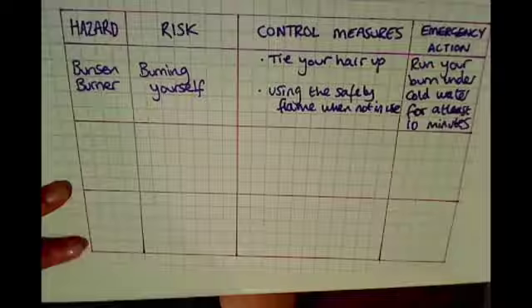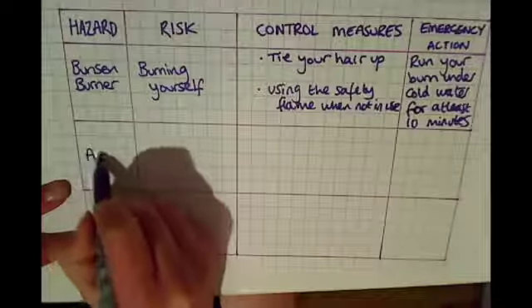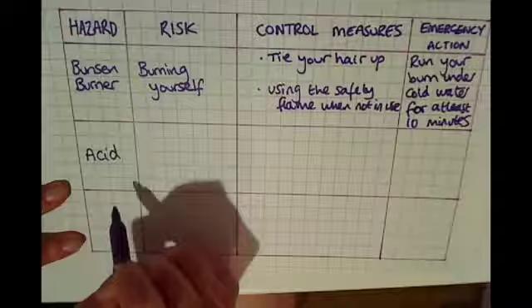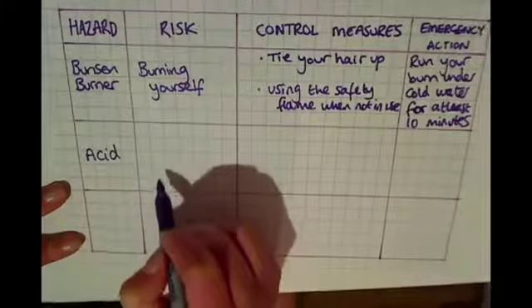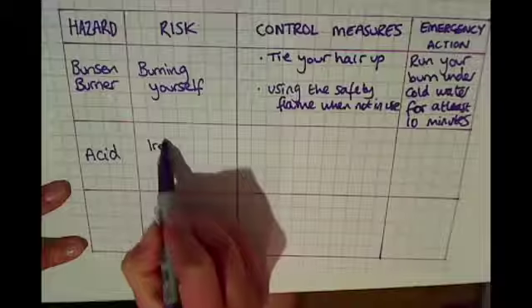Okay, and for another example, we might be using acids. And a risk for using acids would be that it would irritate our skin.